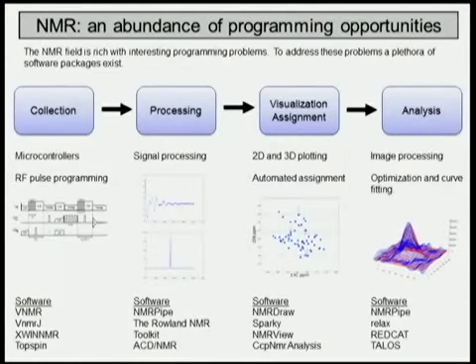One thing that I really found exciting about NMR as I was entering my graduate work was that there's ample opportunities for programmers. So in the collection and the processing and in the visualization and assignment and in the analysis of NMR spectra, all of these have lots of interesting programming opportunities, and they include a lot of complex mathematical fields.